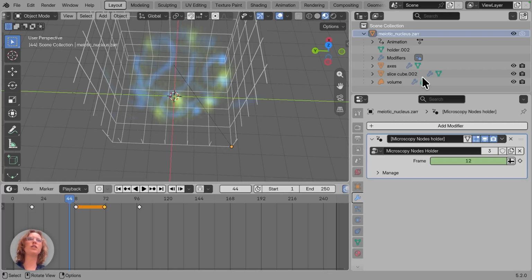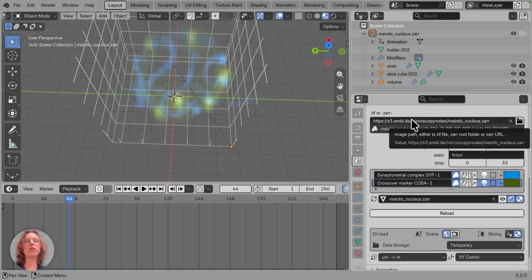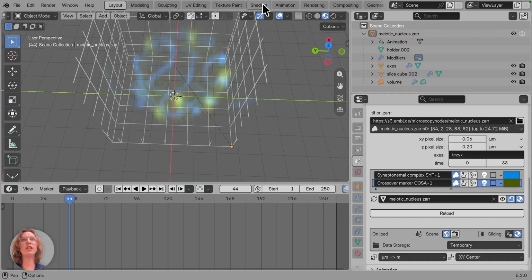So let's summarize what we've learned. We can load our data from a local file or a distant Zarr. By putting this in here, we can select a scale. This is very small, so there's only one. We can change our metadata. We can change how we're going to load things, and then how it's visualized in the shader. Then we can slice, we can change our time axis, and we can do scattering or emissive renders. So figure out how you want your data to look at the end, and please follow along with the example datasets I have and figure out how to handle your own data.